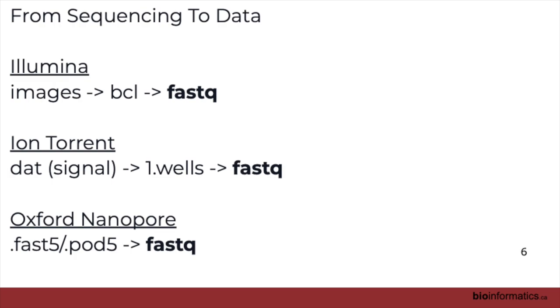Okay, so sequencing the data. You see in all these lines here. Actually, I forgot PacBio, although I do have a slide on it. We're really trying to get down to generating data in a common format, FASTQ. I'm going to talk a bit more about that data format tomorrow, but there's a bit of work that still needs to be done from each of these sequencing platforms before we actually generate those files. That's kind of at the top of our analysis pipelines.